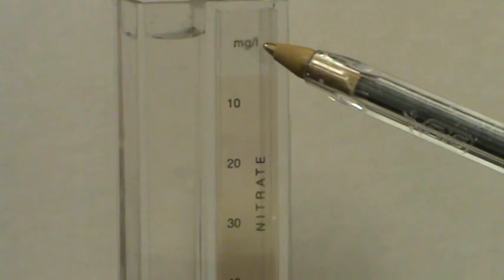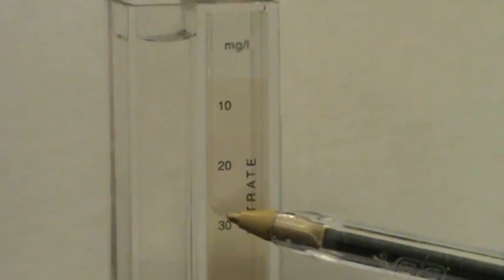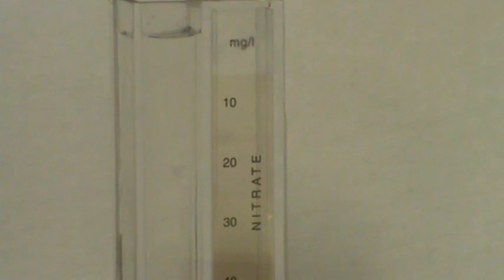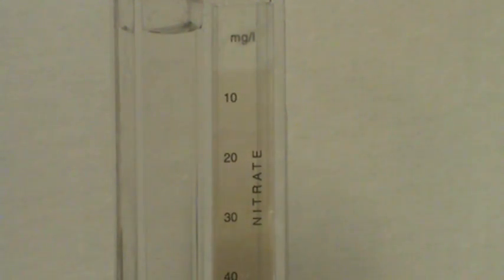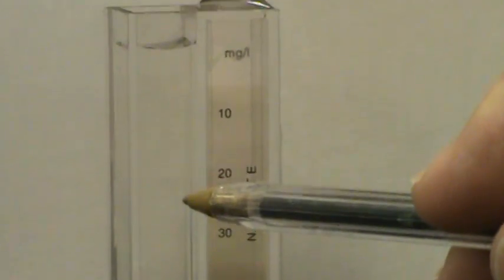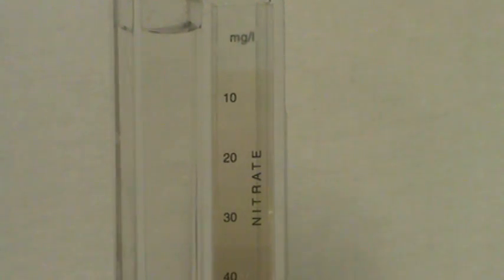Now, on the nitrates, the milligrams per liter is here at the top. We have 10, 20, 30, 40, and 50. Again, nitrates, nitrogen in the water. This is usually some kind of human or animal contamination. This is coming from an irrigation well that's probably 150 to 200 feet deep. And if it's changed color, it has just barely changed color from the naturally occurring nitrates in the soil. I am going to call this a zero because I'm just not seeing any change whatsoever. So let's go back to our laboratory form.